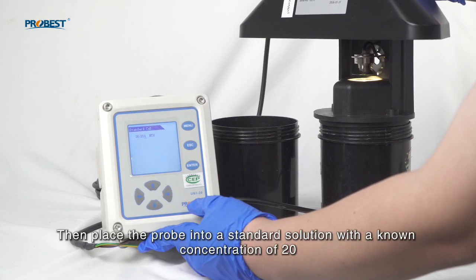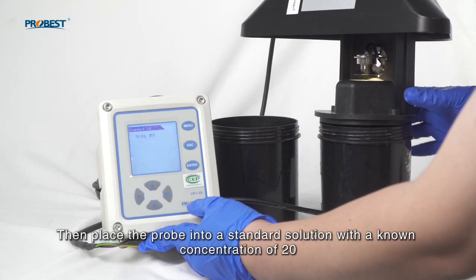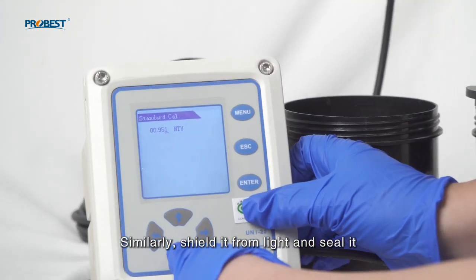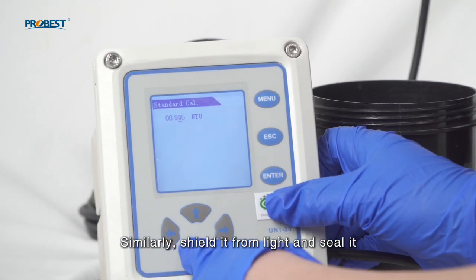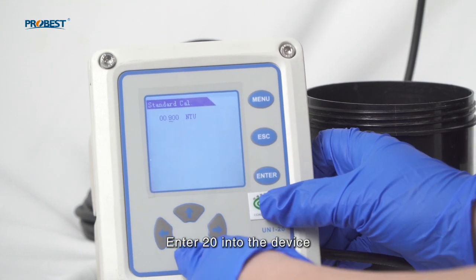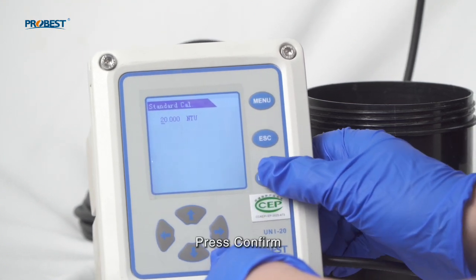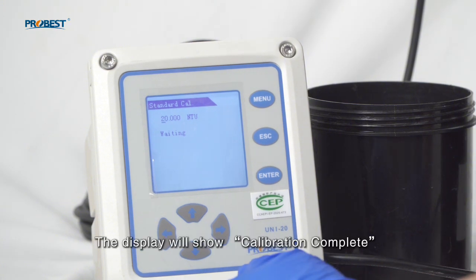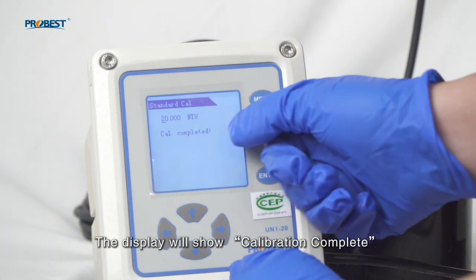Press OK. Then place the probe into a standard solution with a known concentration of 20. Similarly, shield it from light and seal it. Enter 20 into the device. Press Confirm. The device will display Calibrating. The display will show Calibration Complete.